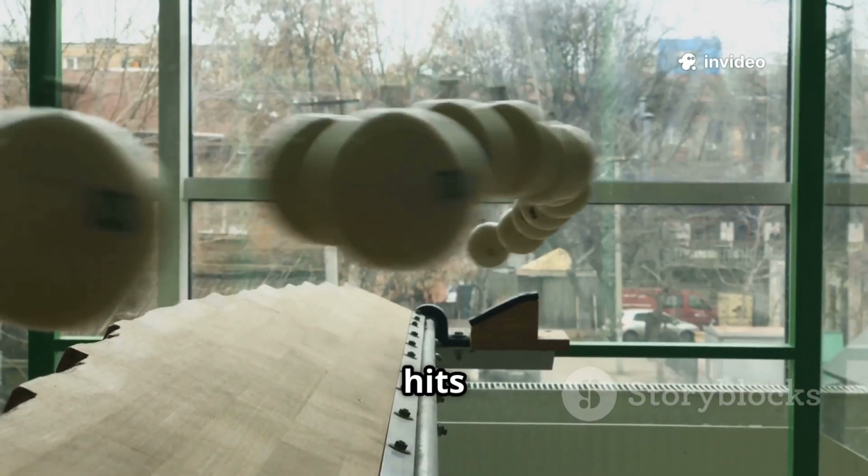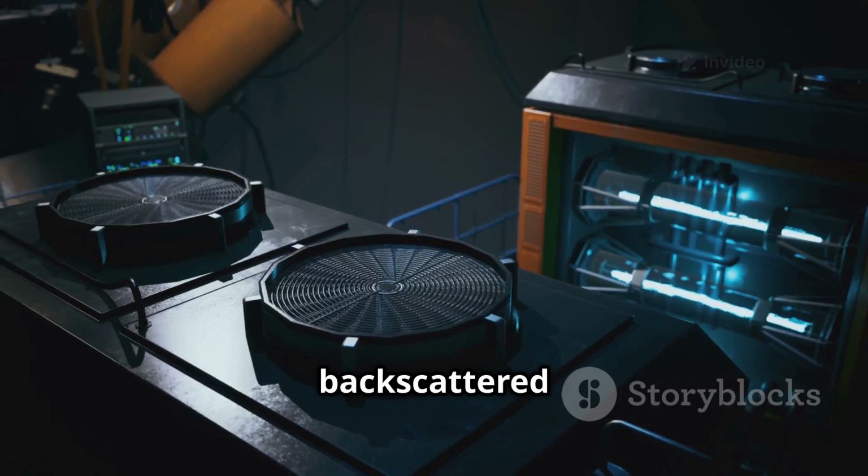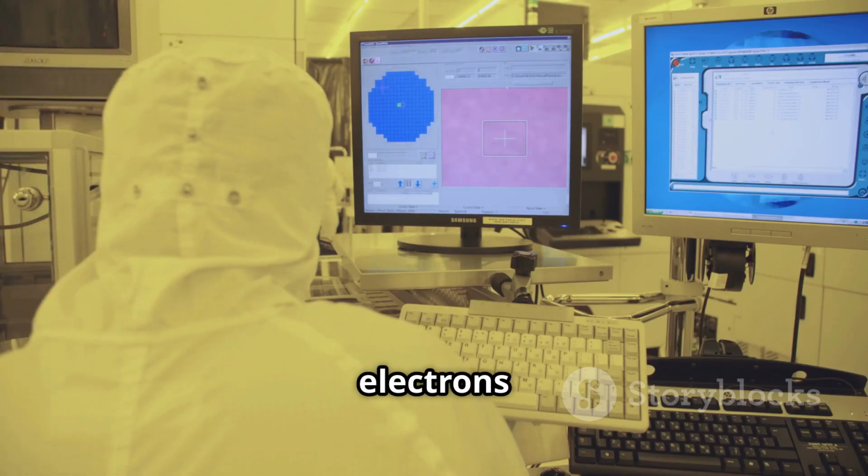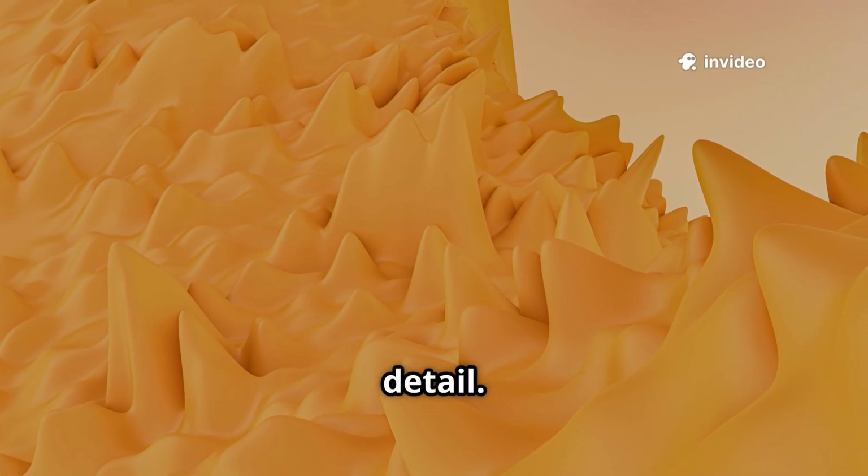When the electron beam hits the sample, it knocks loose different particles and rays. The two main signals are secondary electrons and backscattered electrons. Secondary electrons come from the sample's surface, revealing its shape and texture in 3D-like detail.